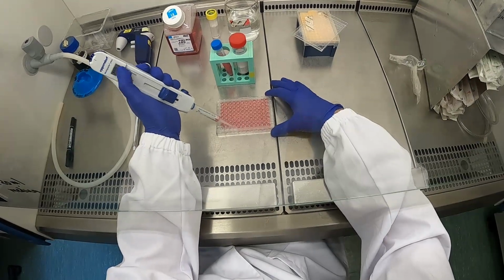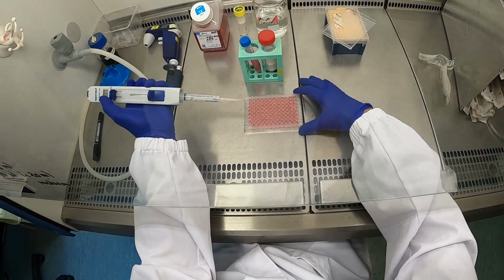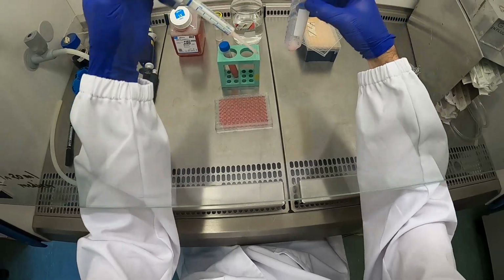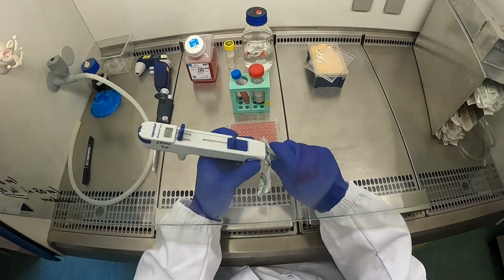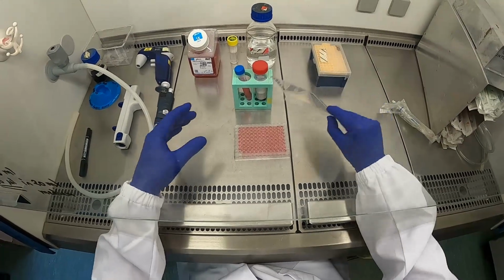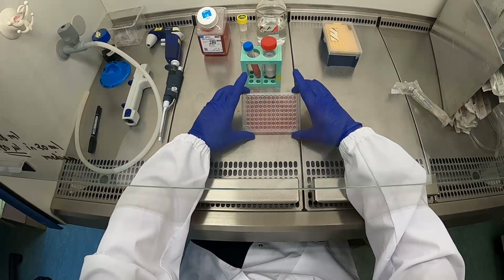Funny thing is that even though we made 20 ml, which should be enough for 100 wells filled with 200 microliters, you always end up with a little bit less. There's some foam, there's some loss here and there. Anyway, we don't need all the wells, we're only going to do the top row. So this is it. Put the plate back into the incubator and see you tomorrow.